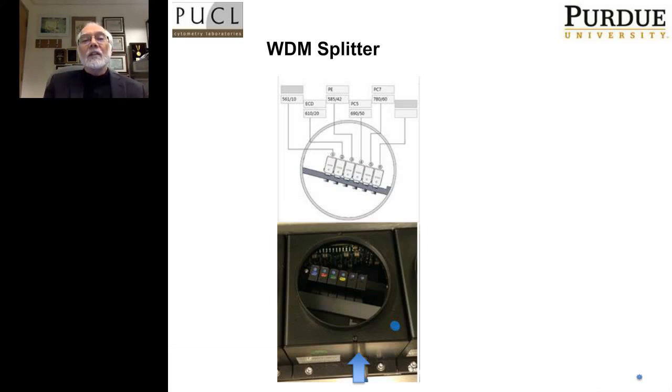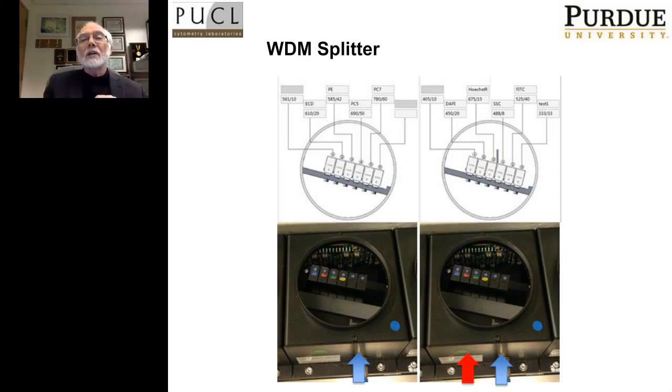Now, that's one type, but the CytoFLEX actually has 2 types. And I just want to show you this, and I will bring this issue up again in a little while when I talk about the different lasers and how those laser combinations can be controlled and manipulated.